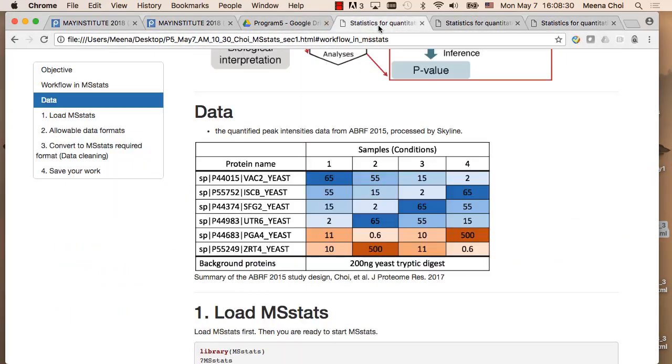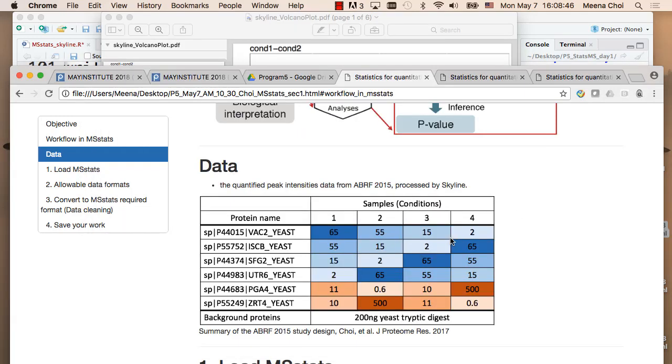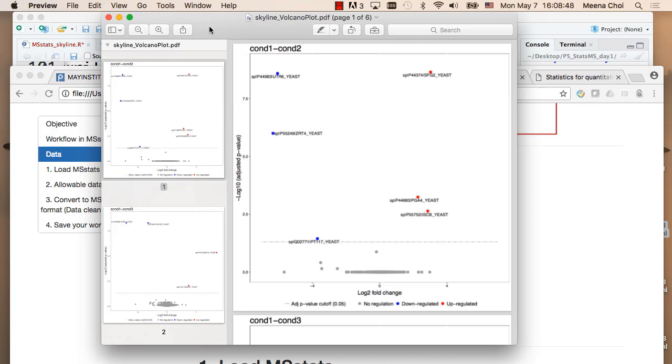So if I come back here, 4405. So 4405 is not here. So we have 1 false. And then 55752, 55752 here.